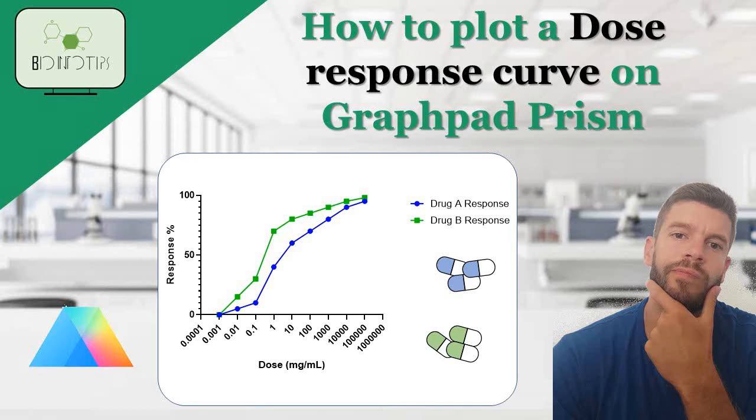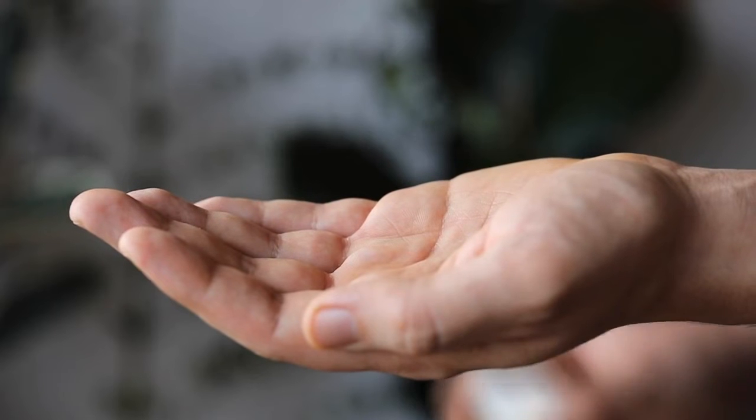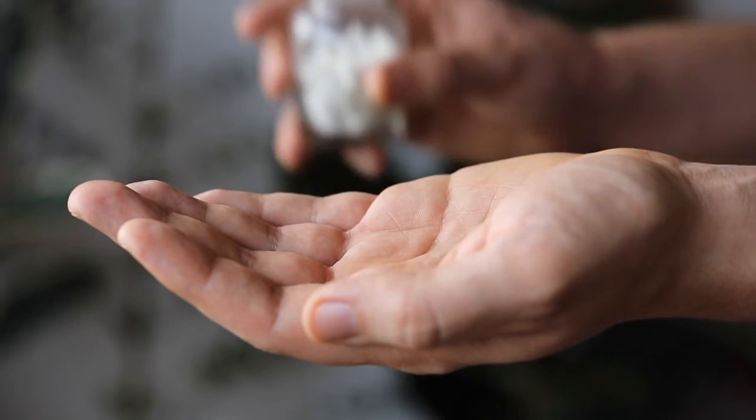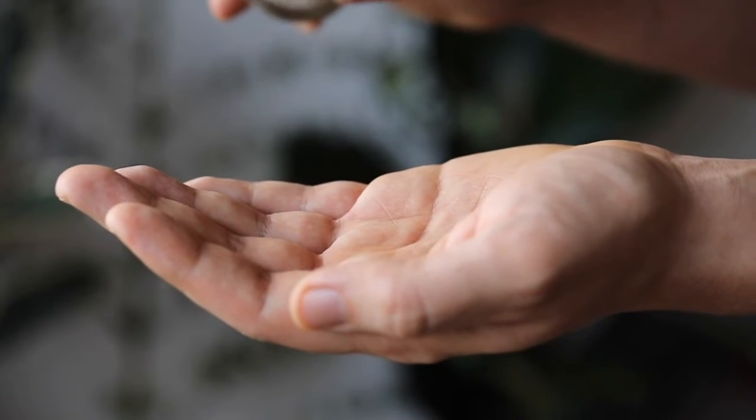Welcome back, viewers! In today's tutorial, we'll be exploring how to create a dose-response curve using GraphPad Prism.